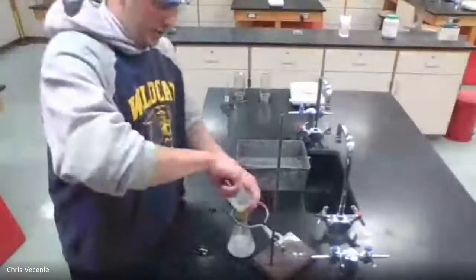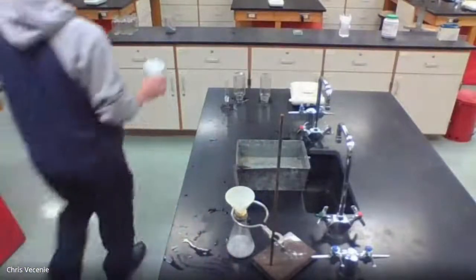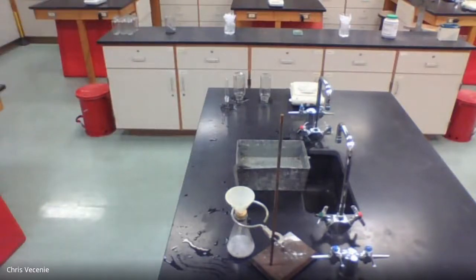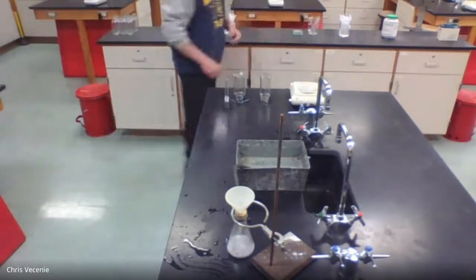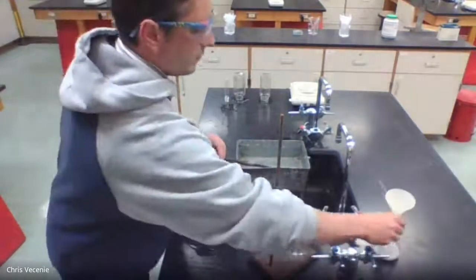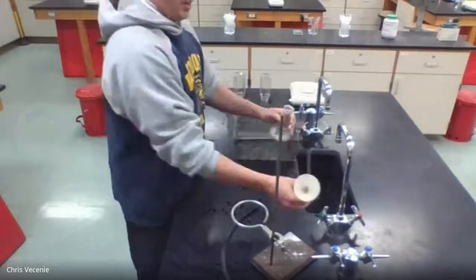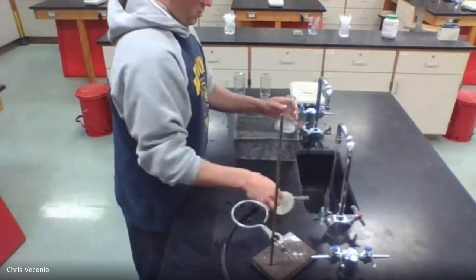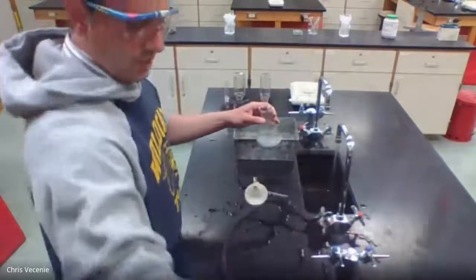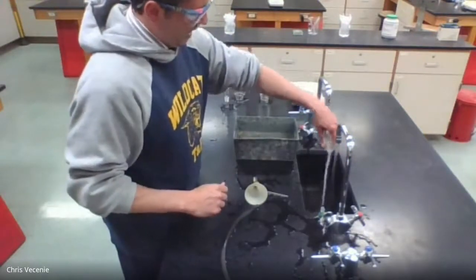Once we have that, just like before, it's cleanup time. And I'm going to take my acid back to the middle. There'll be a separate beaker for the pipettes that we've used. So we just toss the empties next to it. Taking my tube off, set my generator off to the side just for a minute. Let's slide the water, break down my generator. This time, the zinc is reusable. So what I'm going to do is fill this guy with some water, make sure we're trying to make that acid as safe as we can.